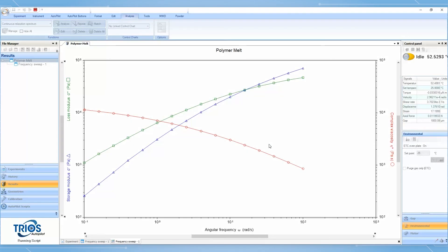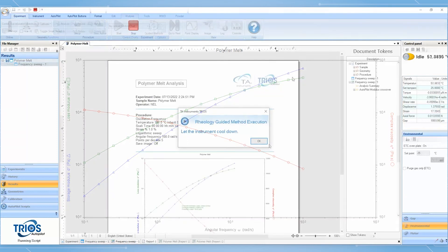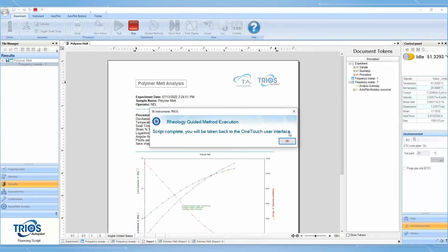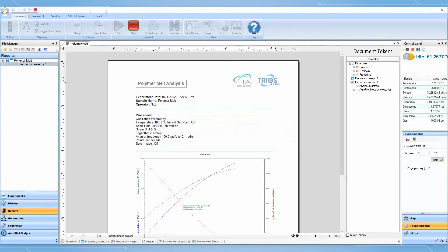After the test is done, the Guided Method will automatically apply an analysis template and report key performance indicators, such as the crossover frequency and modulus, which can be correlated with the molecular weight and molecular weight distribution.